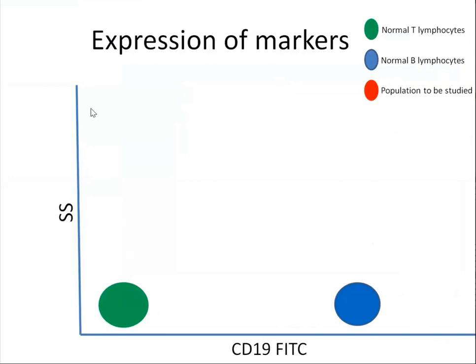just assume that you need to tell the expression of markers based on the internal positive and negative control. For example, let's assume we are analyzing a case of leukemia and lymphoma. So you are analyzing a marker CD19 in the blast. It is not enough if you say just the blasts are positive for CD19. You can't just say that and stop. You should comment on the intensity of CD19 in the blast. And how do you do that?